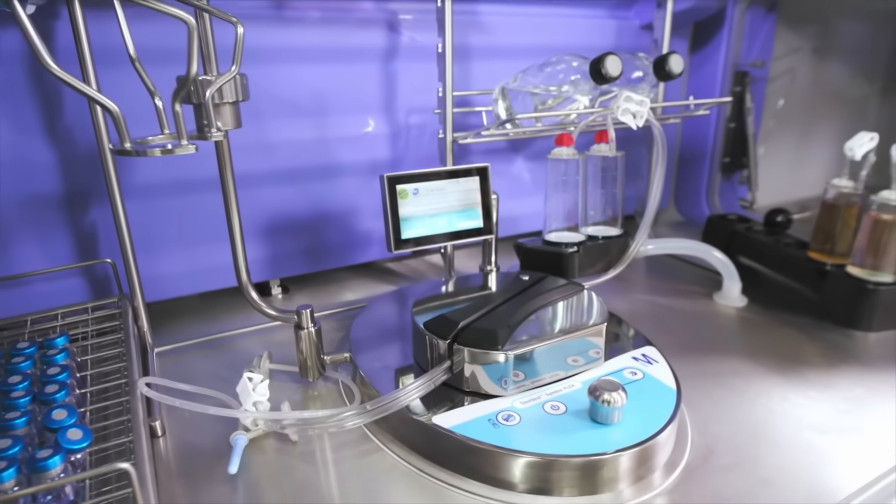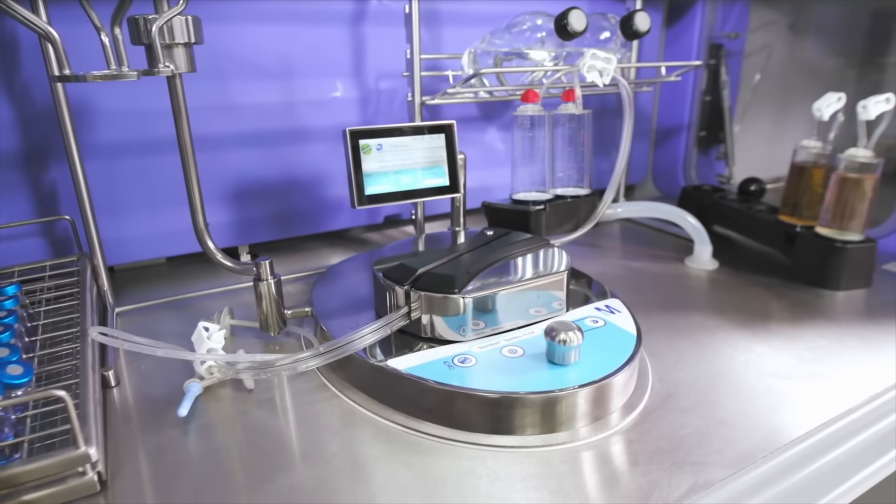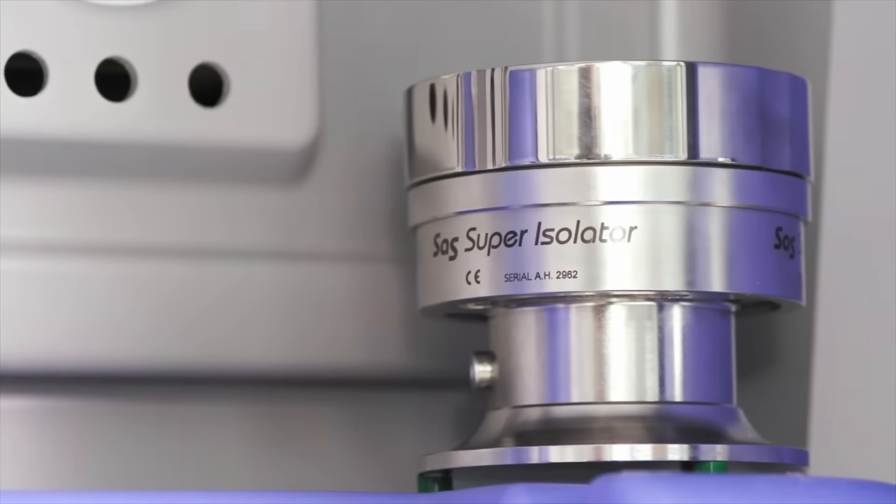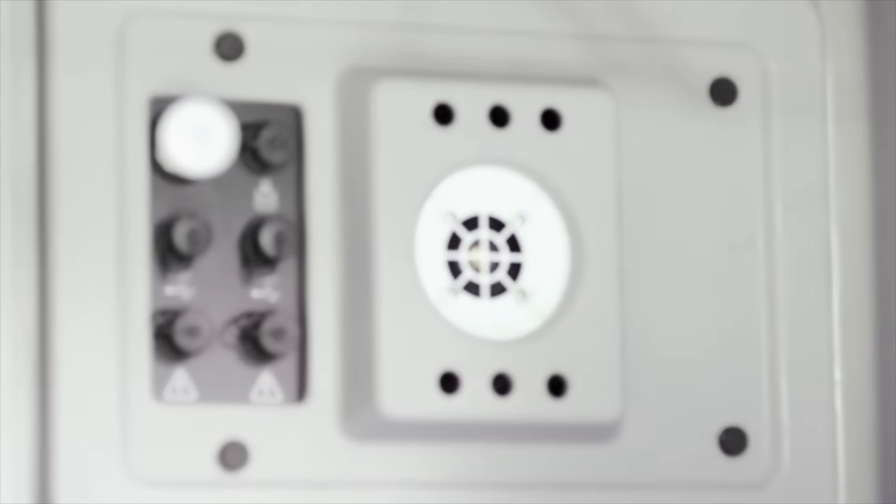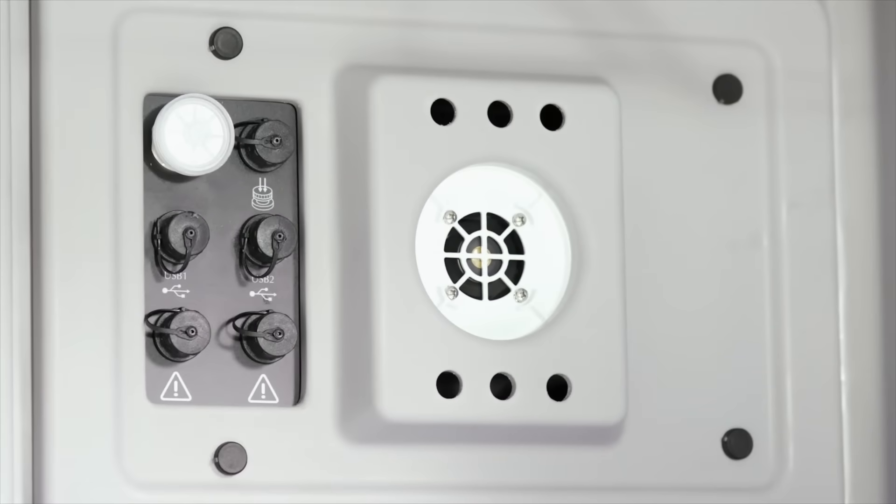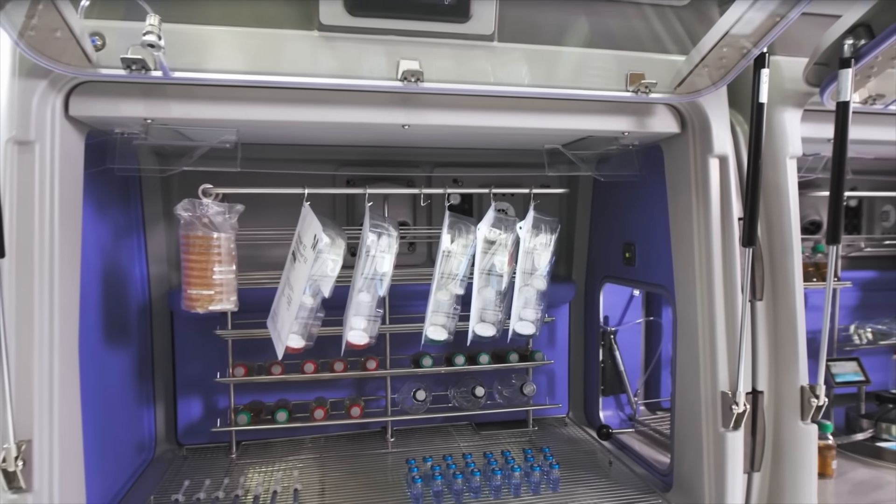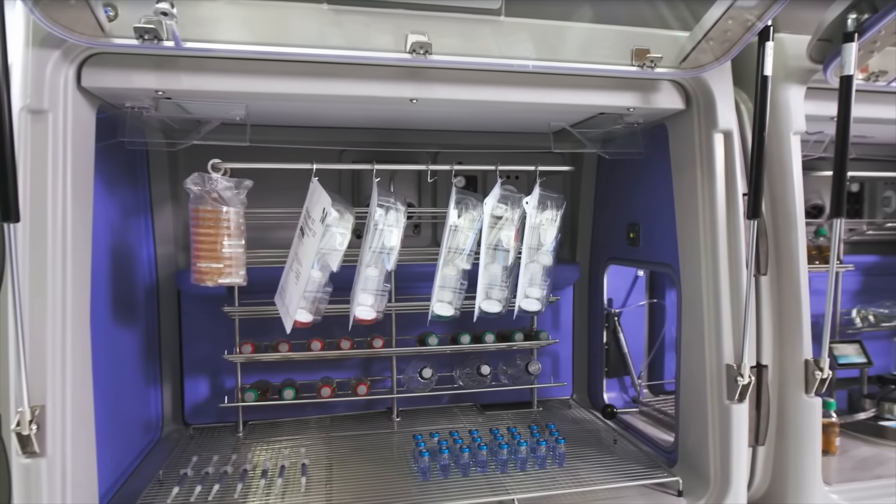Integrated options such as optional integrated sterility test pump from Merck Millipore, four levels of viable and non-viable environmental monitoring to select from, can ensure strict quality standards are met, and racking solutions allow for high throughput and provide operators with ample room to work comfortably.